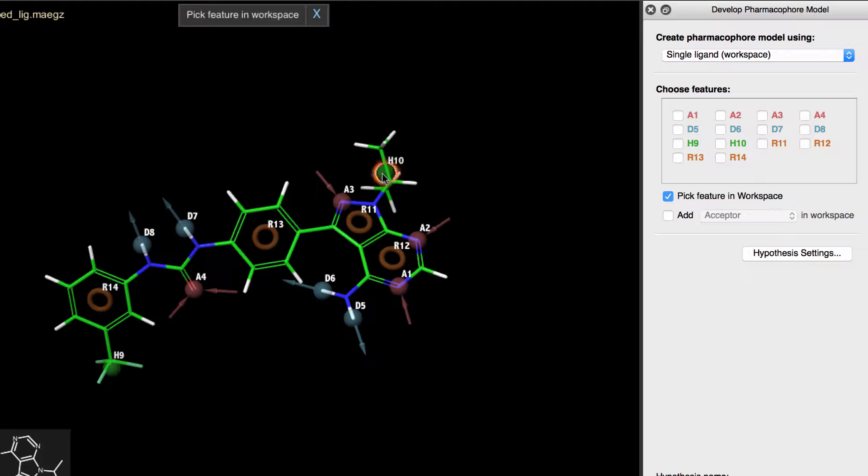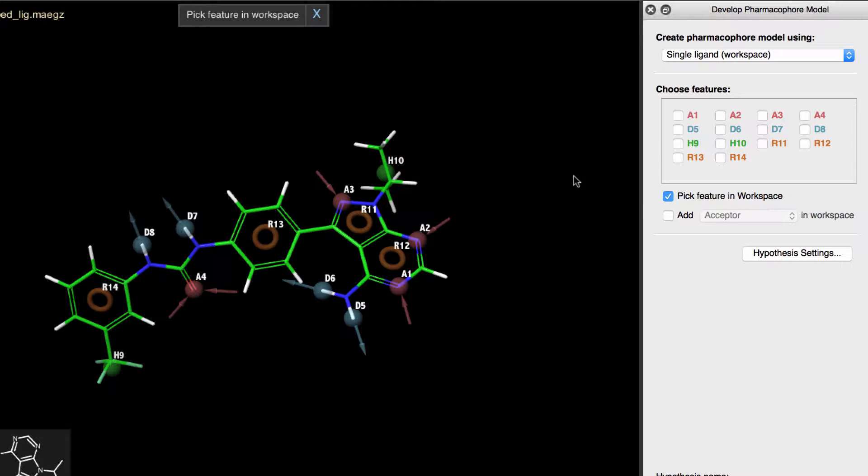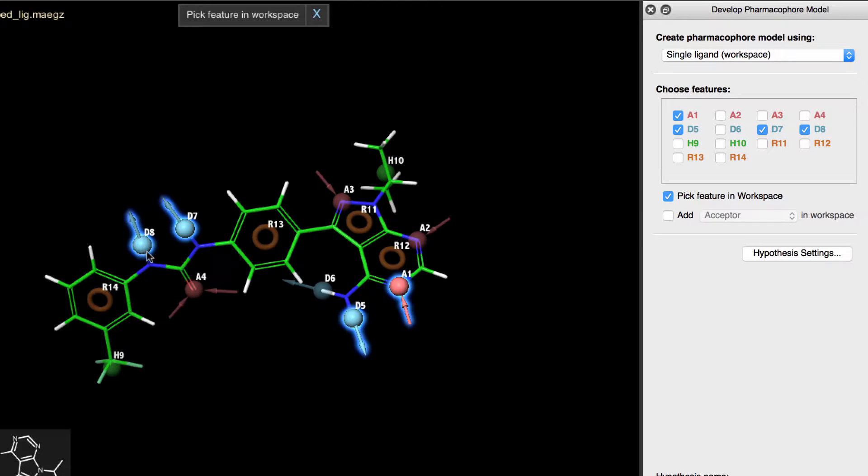To do that, we can pick the features in the workspace, as instructed by the notification banner and the Pick Feature in Workspace checkbox. Notice you can also pick features by selecting their corresponding checkbox in the grid.